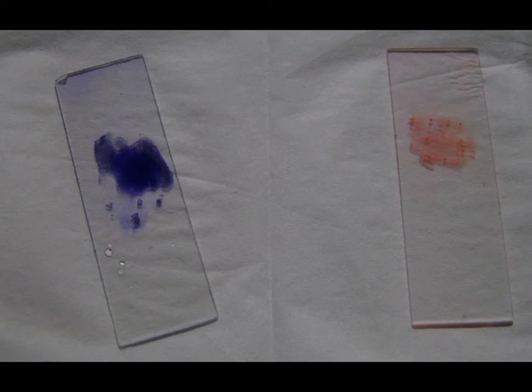So at the end of a gram stain, your slide will either look like this one right here on the left or this one right here on the right. And so it appears that we have a gram positive purple, and here we have a gram negative pink.